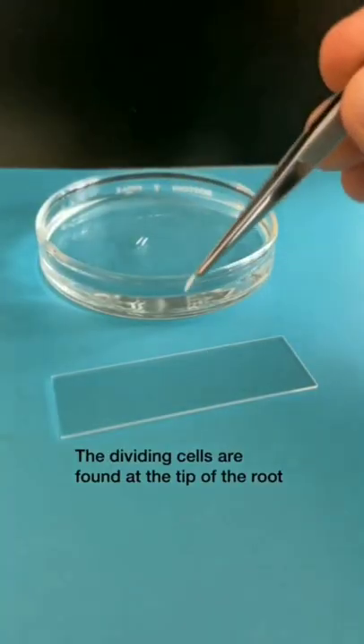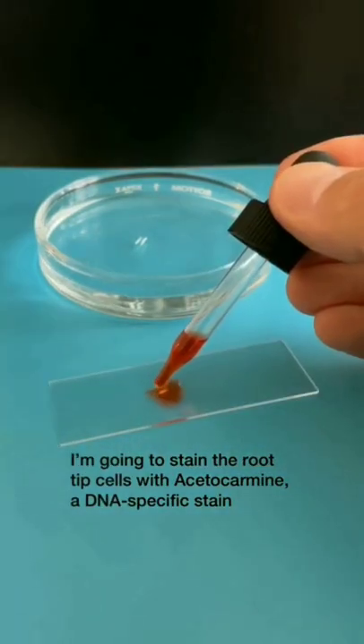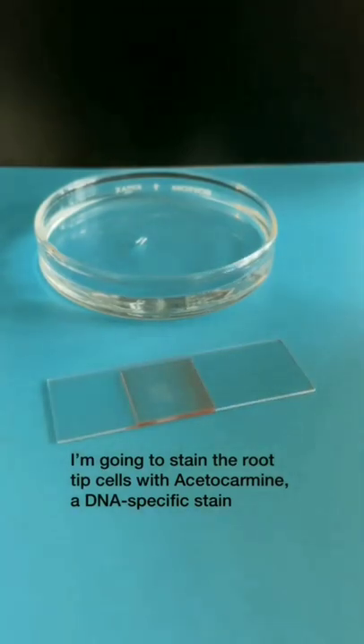Adding it in water, the dividing cells are found at the tip of the root. Stain the root-tip cells with Acetocarmine, a DNA-specific stain.